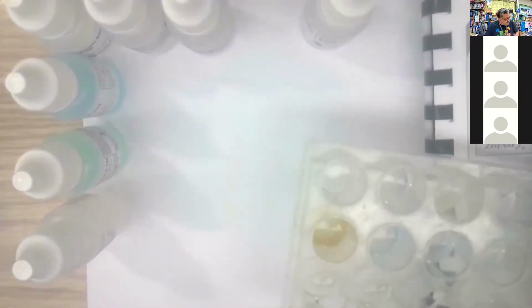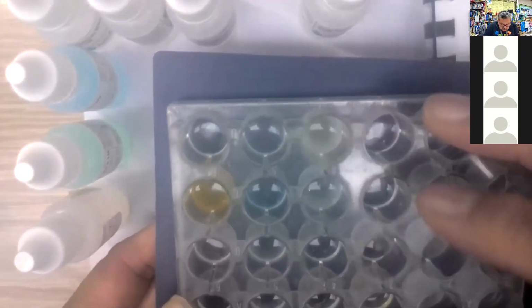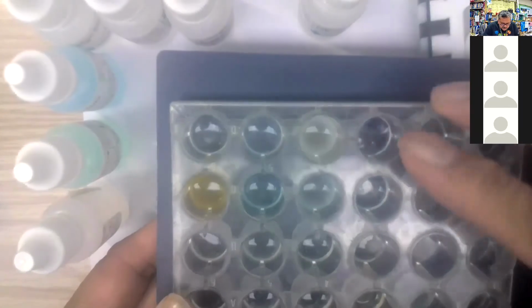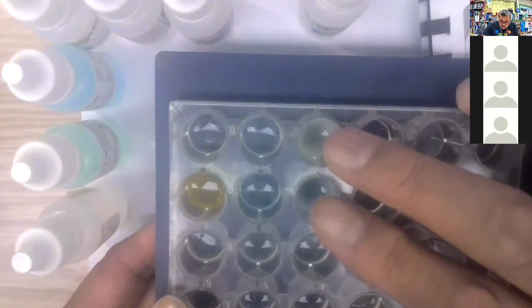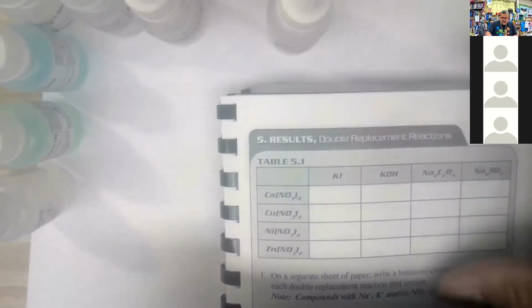Shaking it up a little bit and putting it on a dark background, looking at the third column. Is it powdery? That's the question. No, not really. These two, though, did have a color change. So in the third column, right here on the chart, these two, this was white, this was blue.